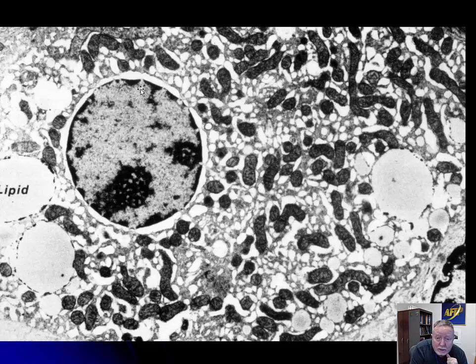And I want you to take a look at the cytoplasm. Looks darker than normal, doesn't it? And that's because those swelling smooth endoplasmic reticulum are compressing them. Now, when we put more water in, it's going to become very lucent again. But right now, it's compressing all of the fibrils and the glycogen, whatever's in there, sort of together, and gives the appearance it's darker, but it's really just sort of compressed because of the dilation of the smooth endoplasmic reticulum. Okay, this particular case was a case of carbon tetrachloride intoxication.